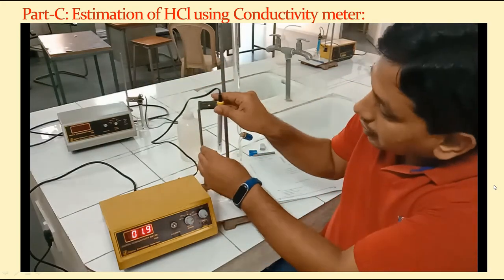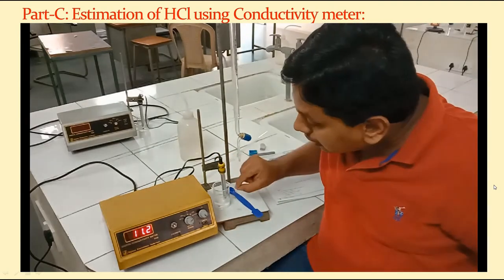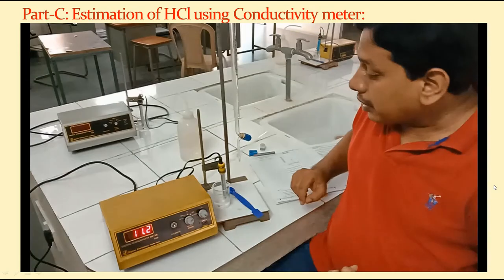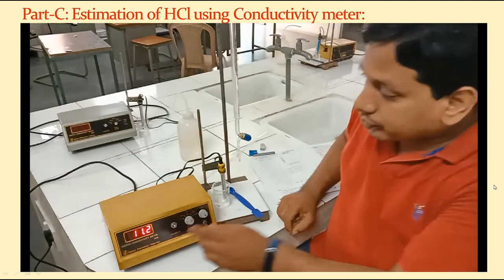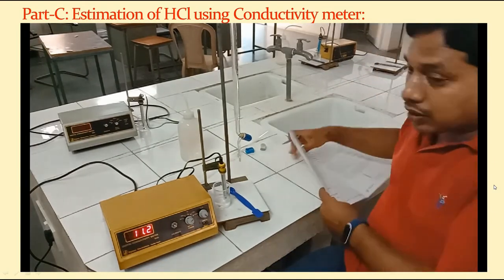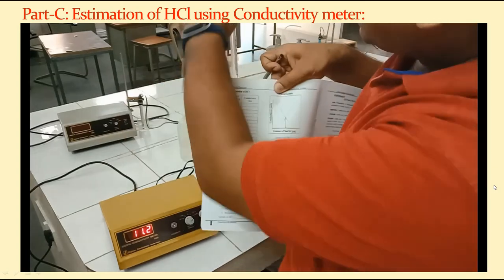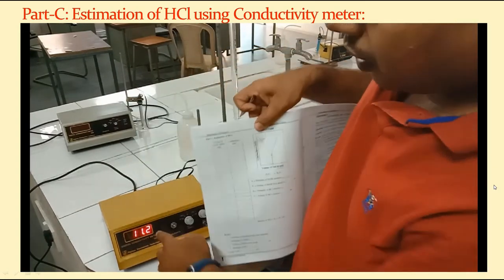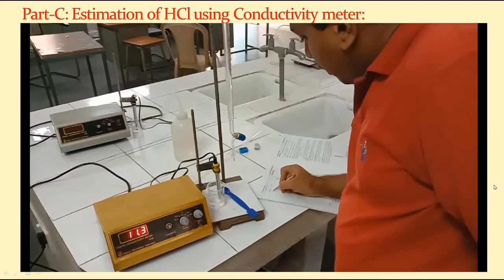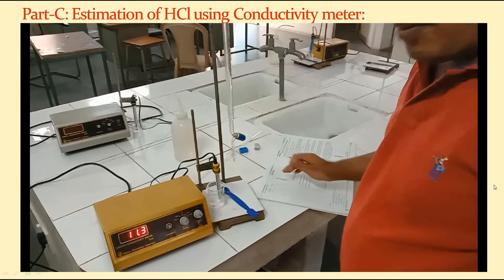Now I place this conductivity cell in the test solution, and we must ensure that the cell is completely dipped. The platinum electrodes must be immersed properly in the solution. Then we can start the experiment. This is the initial reading shown by the solution, 11.2, and let us note this down. This is the tabular form we have: volume of the base added, where I am using sodium hydroxide in this beaker, and the conductance which we read on the instrument. So at 0 ml, before addition of the sodium hydroxide, the reading is about 11.3 millisiemens.